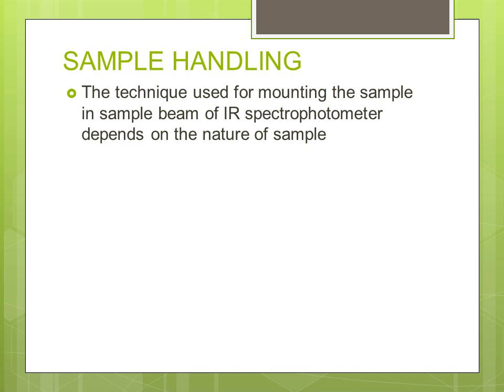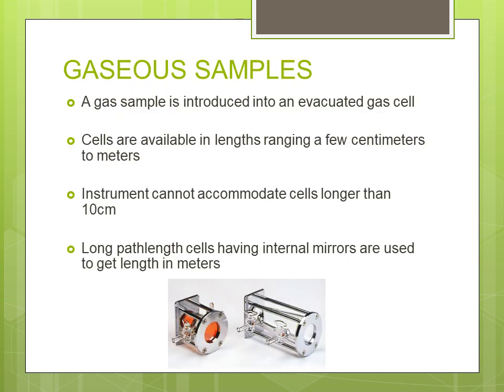Now we will see the sample handling. So what is sample handling? Actually, this is the technique used for mounting the sample in the sample beam of the IR spectrophotometer. And this depends on the nature of the sample, that is, how we will introduce our sample in the IR beam.